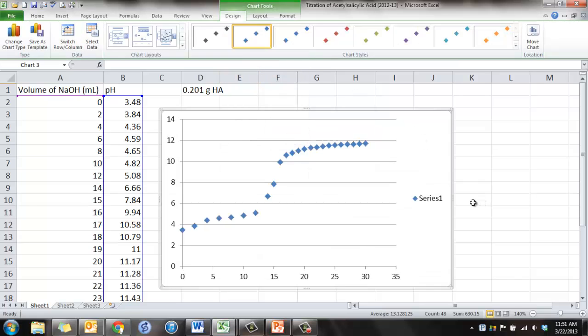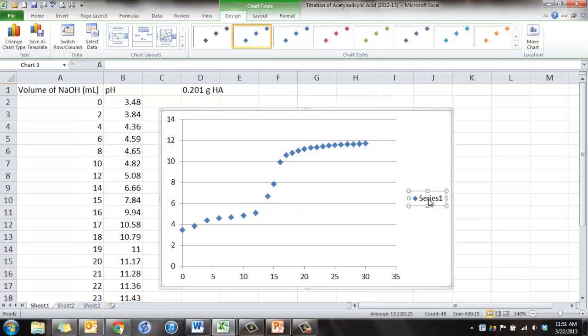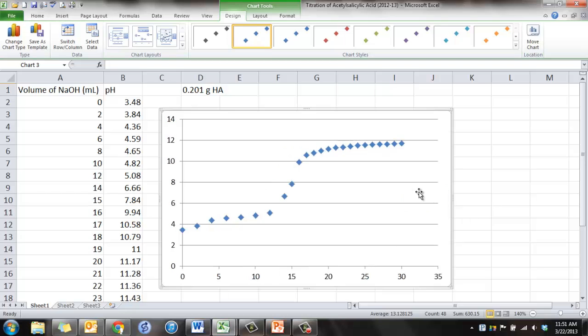The old way Excel worked, it was a little bit better. It actually put titles in, so we have to do that ourselves now. Let's get rid of this legend here because that doesn't really mean too much. We'll get rid of that, and we're going to add some information to our graph. If your graph is not looking like this, you probably put a point in incorrectly. So make sure you double check your points here.